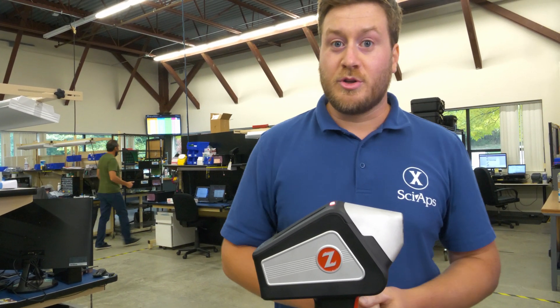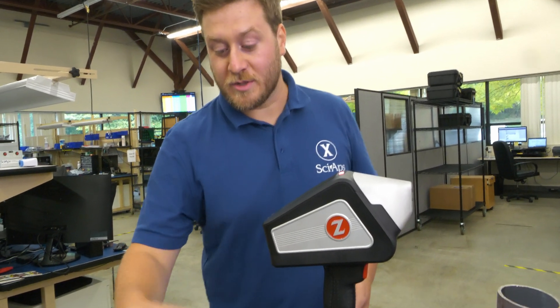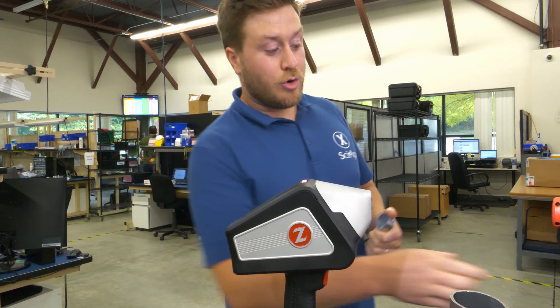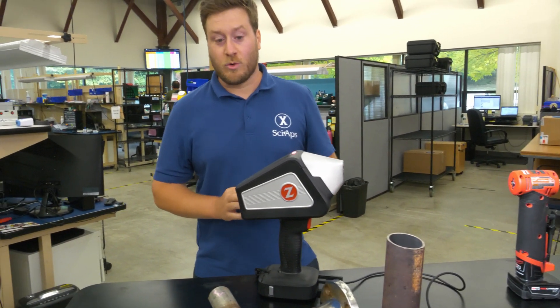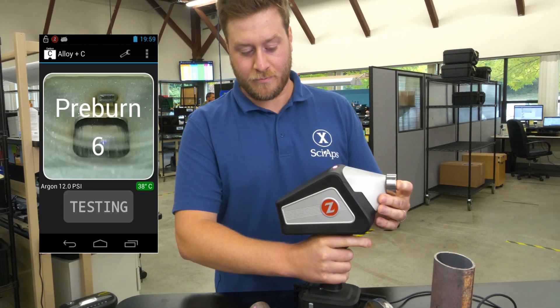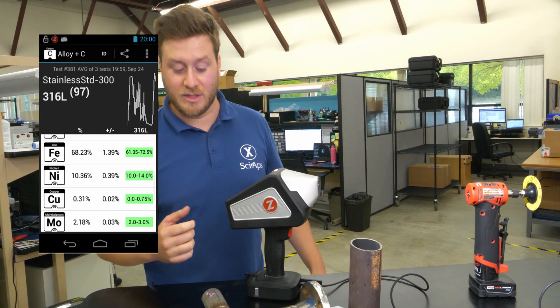I'm going to start off by showing you some L-grade stainless steel analysis. This first sample that I'm going to do is a 316L. It's important to note that you should always grind your samples to prep them of any contamination before you do your analysis. I got that done before we start the video today. If you scroll down you can see the rest of the alloying elements within the sample.